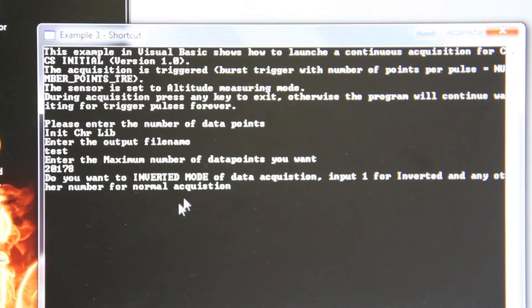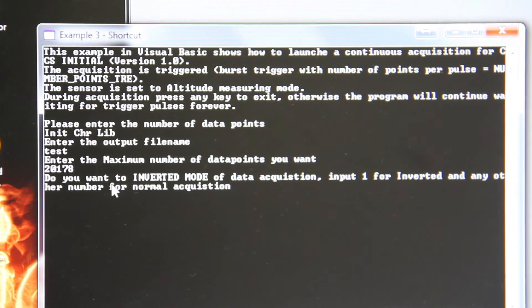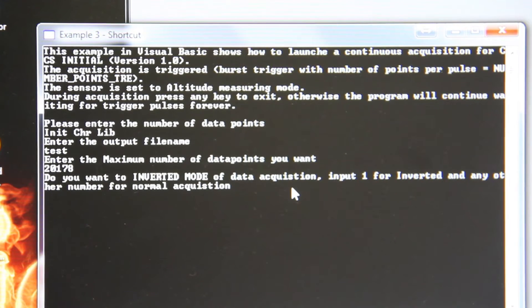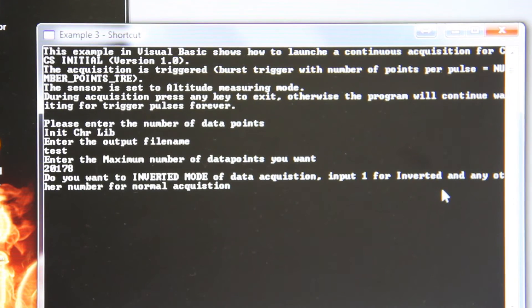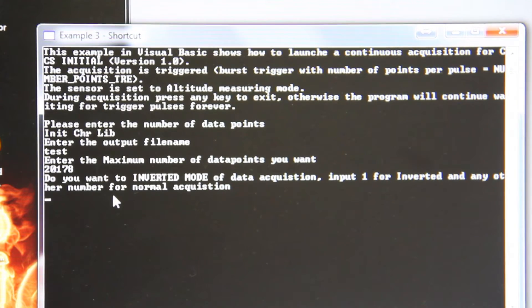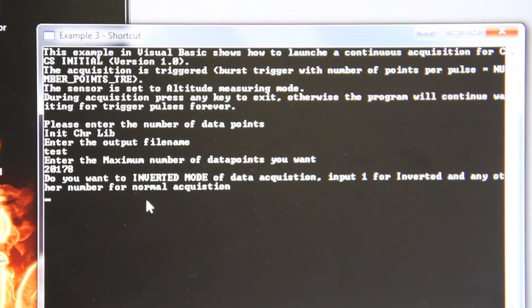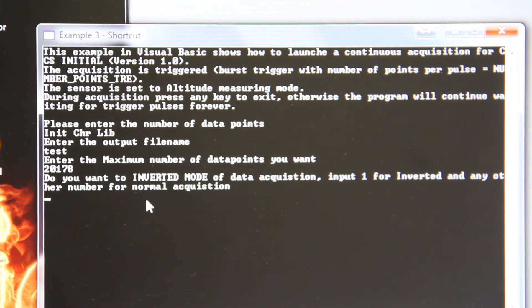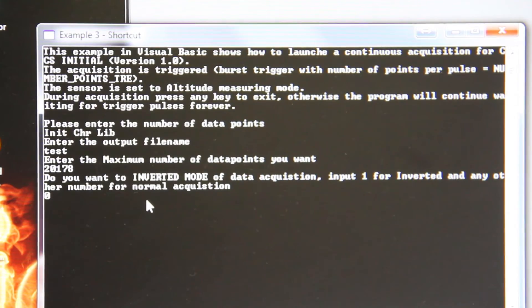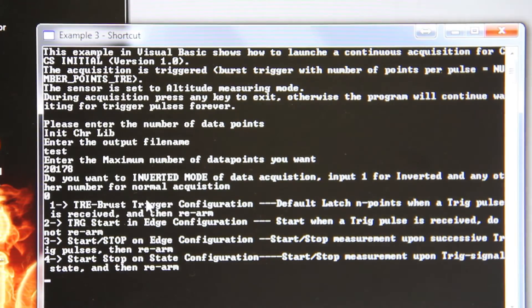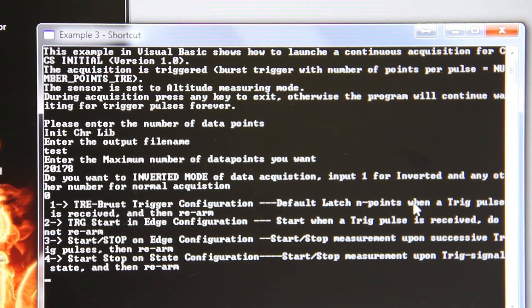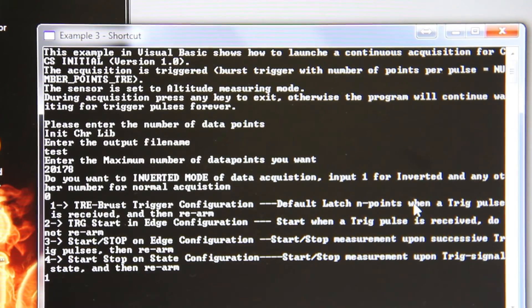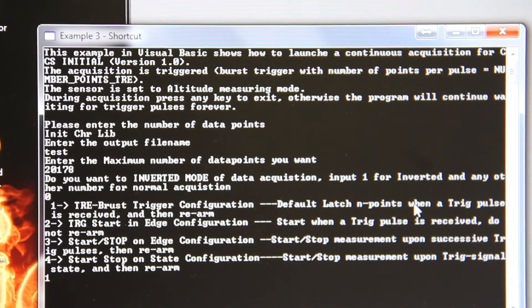Then it will say do you want to invert mode of data acquisition. Input 1 for inverted and 0 or any other number for non-inverted, so you will press 0. Click 1 for burst mode.